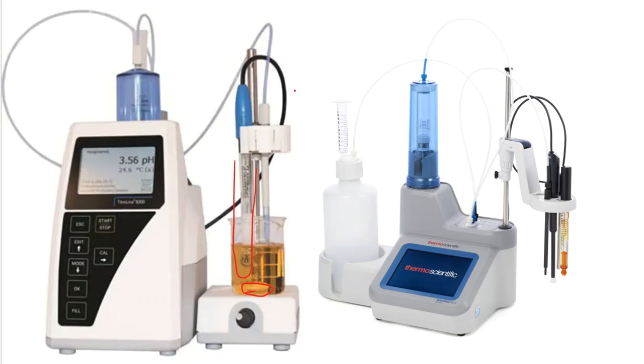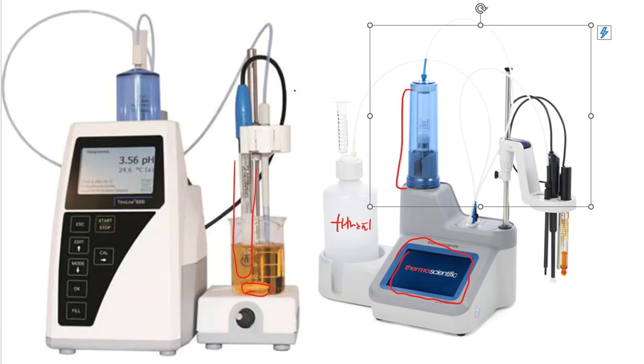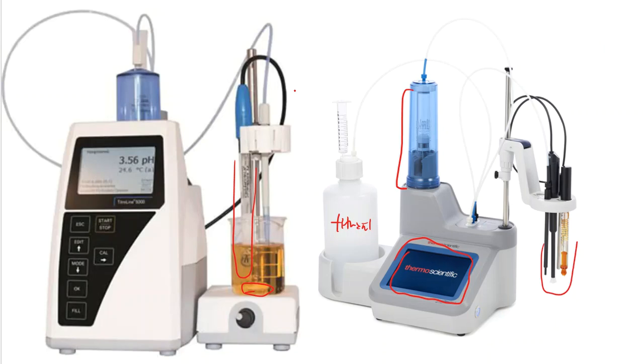To the right-hand side is Thermo Scientific's version of an automated titrator. So no difference. It's just everything's built in together, right? Instead of separate pieces and parts. But all the basics are still there. So very often, a touch screen is going to be here in front. That allows you to key in information such as sample weight, sample volume, methods, or pick methods. The titrant will go here into the bottle. That titrant's going to get loaded up, and that titrant is going to get filled inside of your burette, which is going to be located here. And then from the burette, if you track the tubing lines, here is where you'll see it end up, and that's where our sample will go with our beaker and a magnet and the pH probe there on the side.